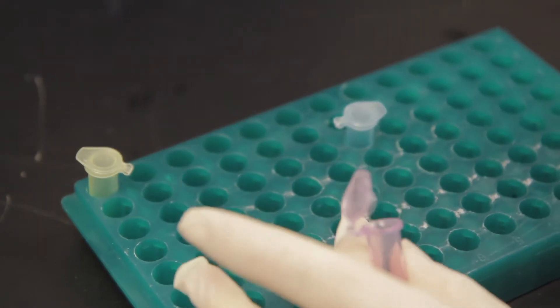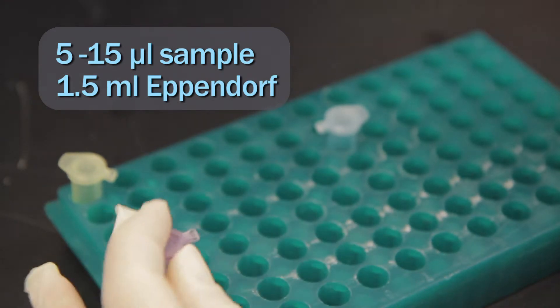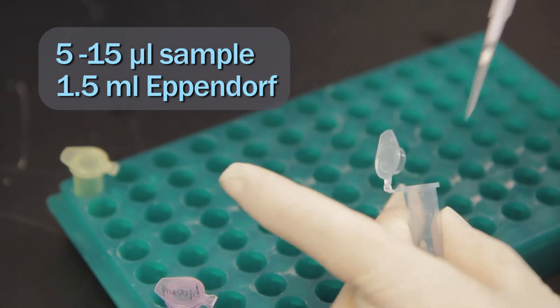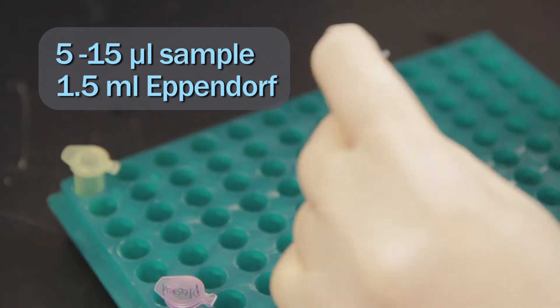If you are returning DNA samples, aliquot 5-15 µL of a miniprep or maxiprep sample into a 1.5 mL Eppendorf.